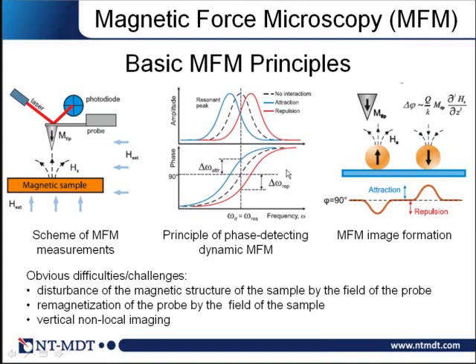So if you have lateral sizes of 100 nanometers, for example, then the changes of the dipole fields in the vertical direction will also be of the order of 100 nanometers. If you have very tiny structures of 20 nanometers, the changes in the vertical direction will also be of the order of 20 nanometers. Should you have very large structures like 1 micrometer, the depth sensitivity will also be very, very large.